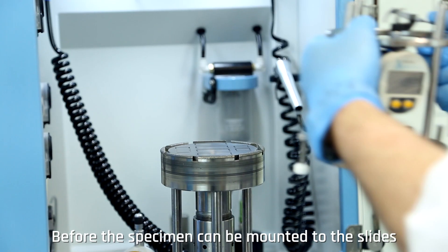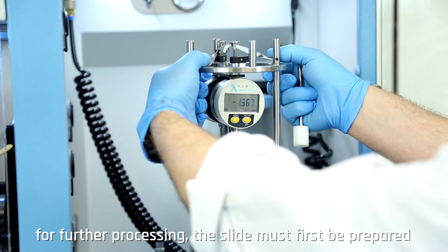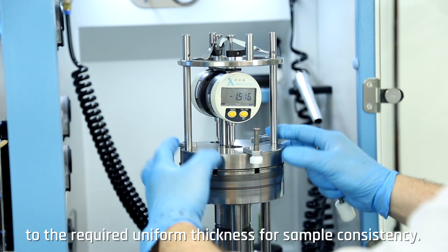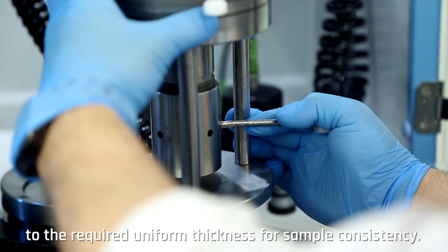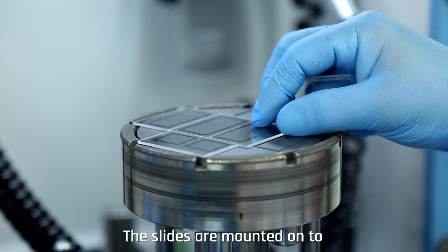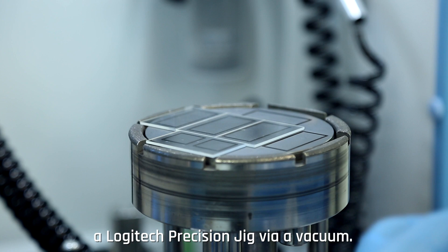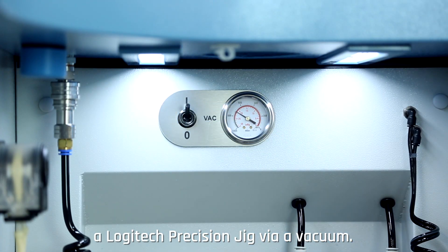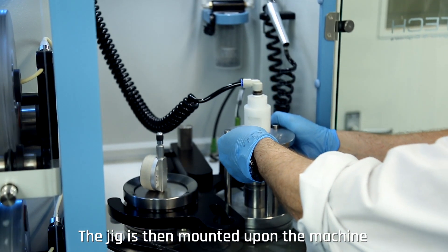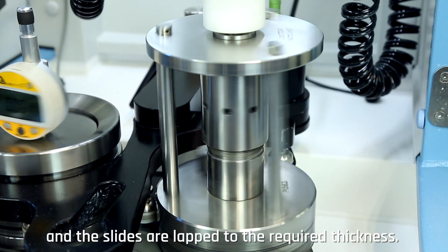Before the specimen can be mounted to the slides for further processing, the slide must first be prepared to the required uniform thickness for sample consistency. The slides are mounted onto a Logitech precision jig via a vacuum. The jig is then mounted upon the machine and the slides are lapped to the required thickness.